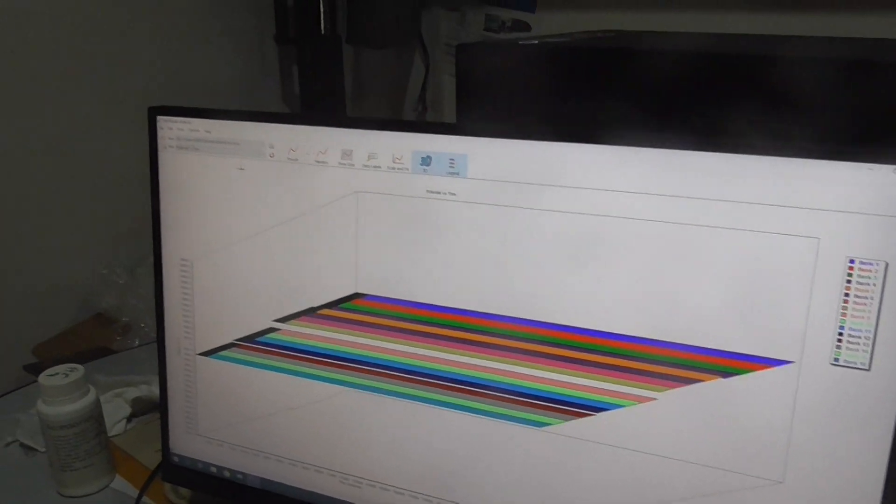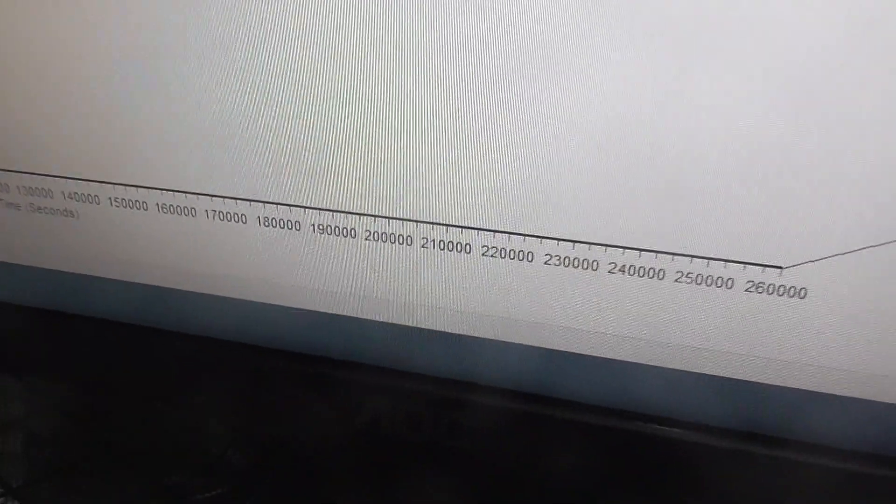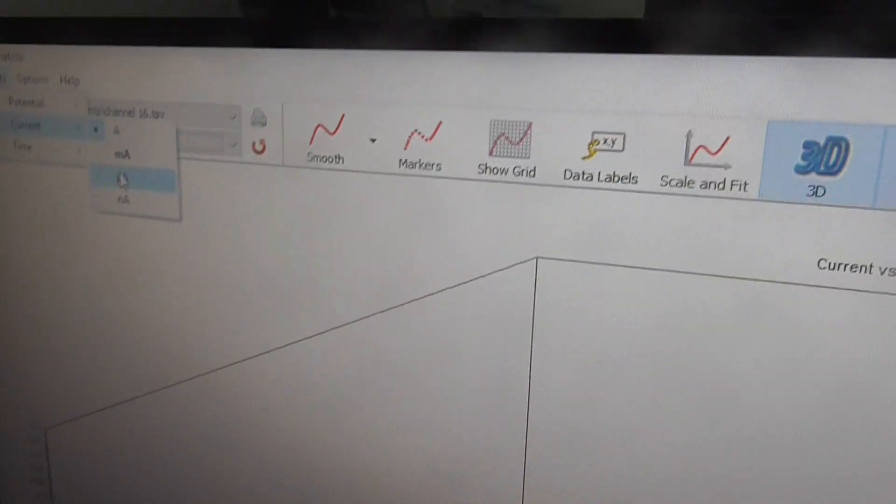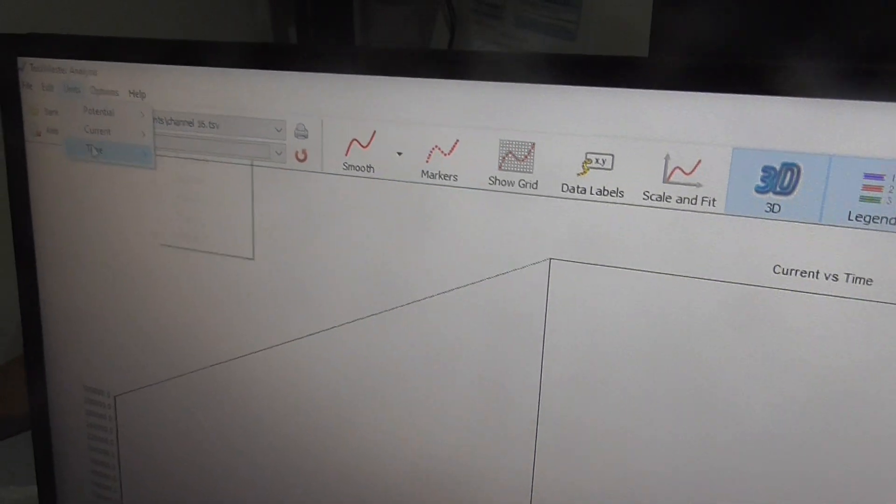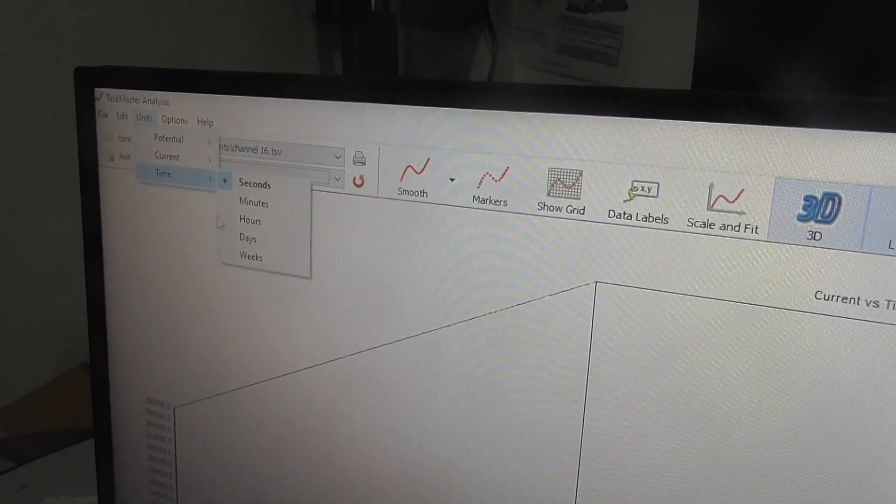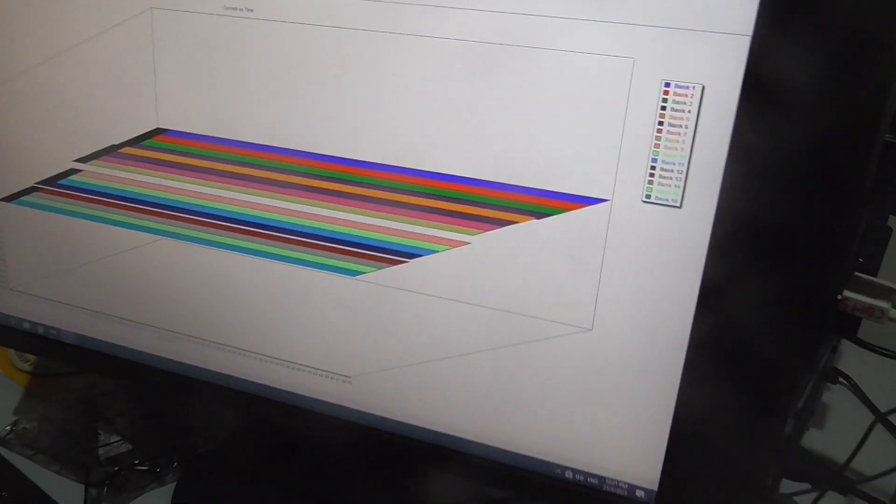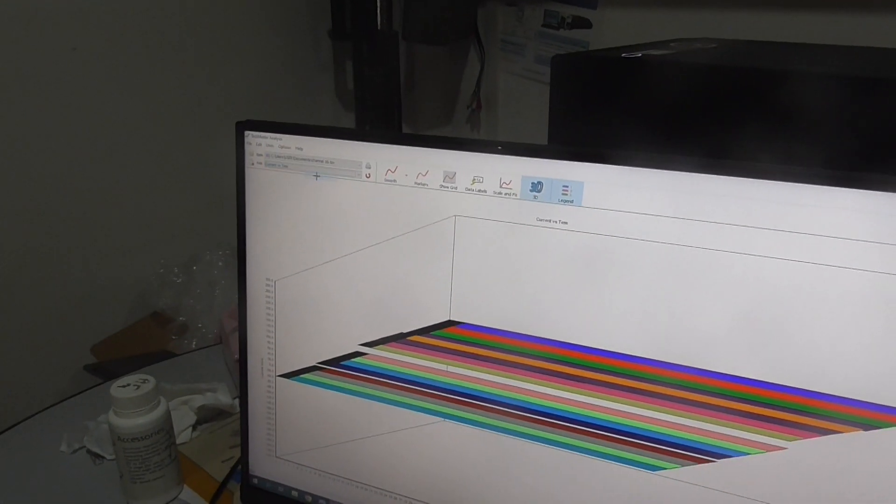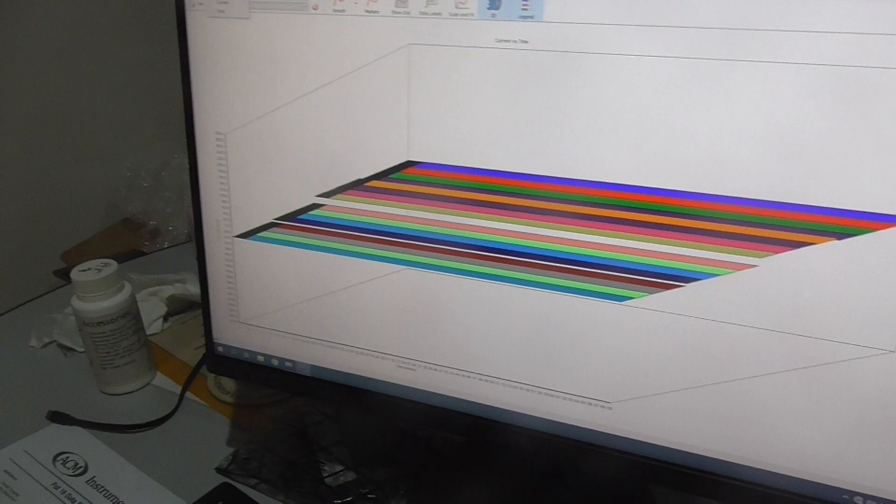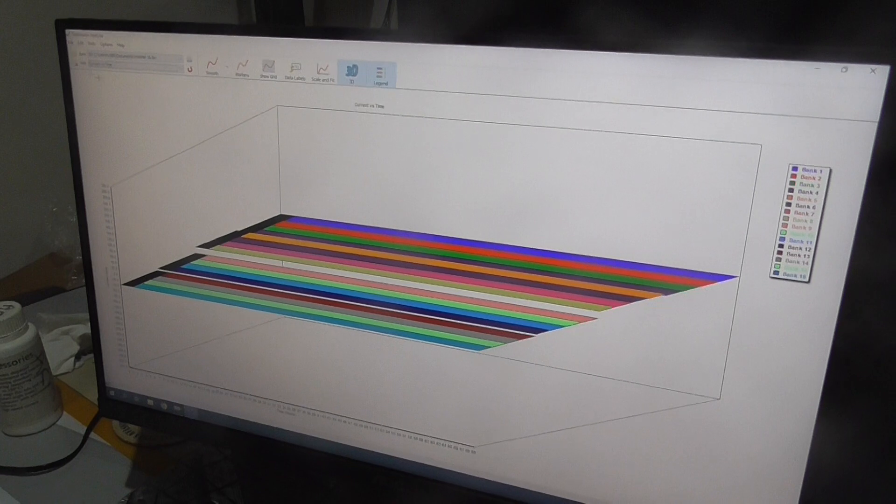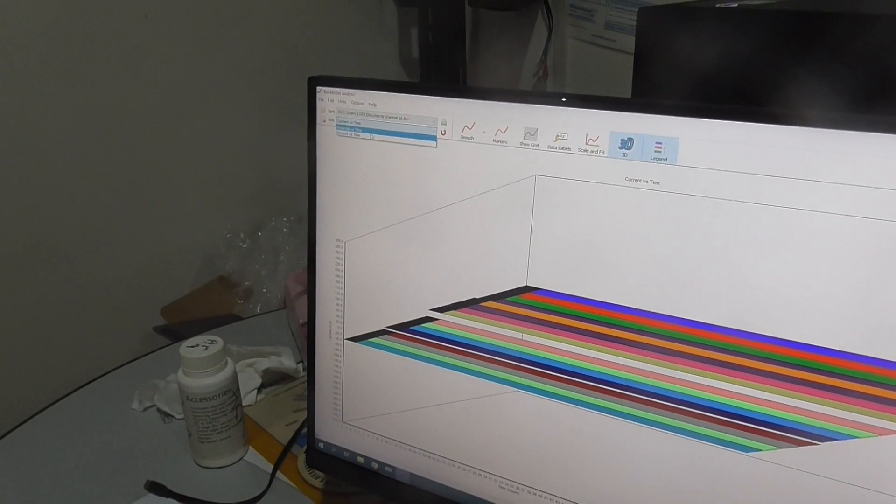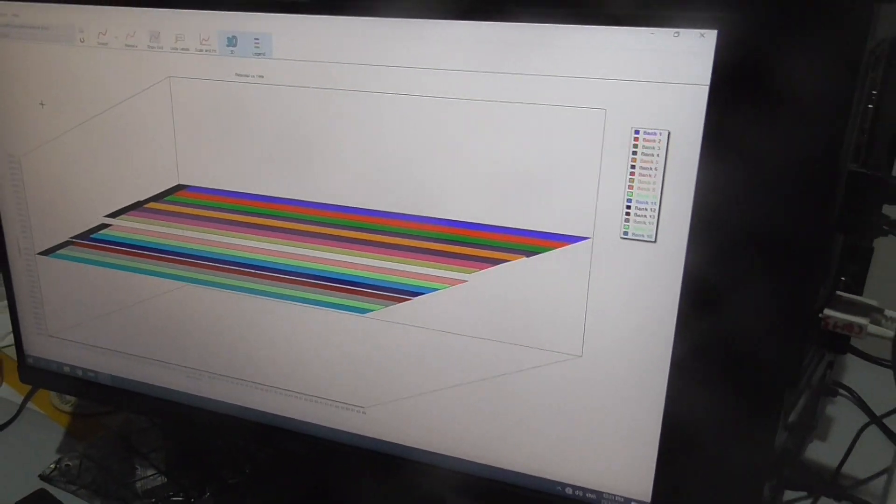You can always change this into current versus time and you can also change the unit, current unit. You can have micro, and you can change the time also. It's already in seconds, but if you want to change it to hours you can change it to hours. Normally people use milliamp depending on the testing that you do. Millivolt as well, but now it's current. If you want to use volt potential, then you change it back.